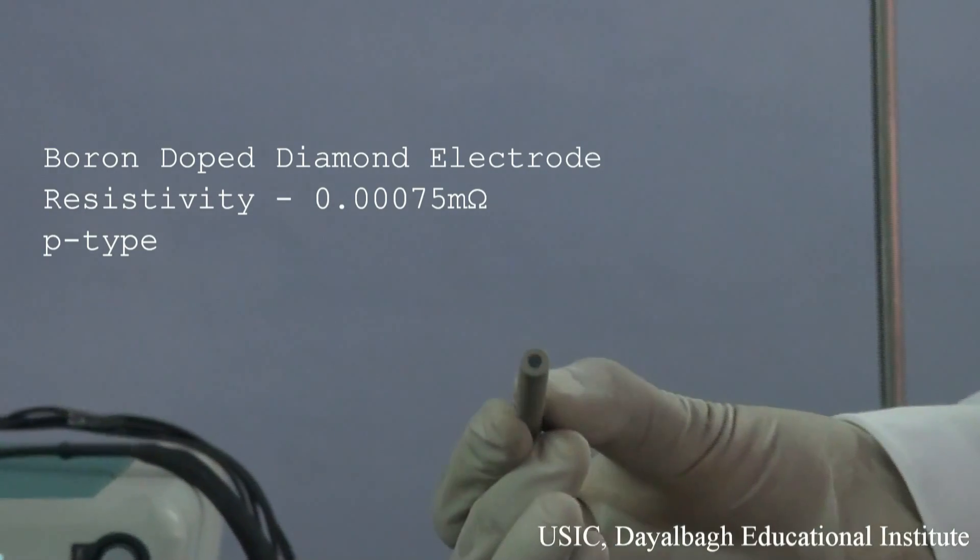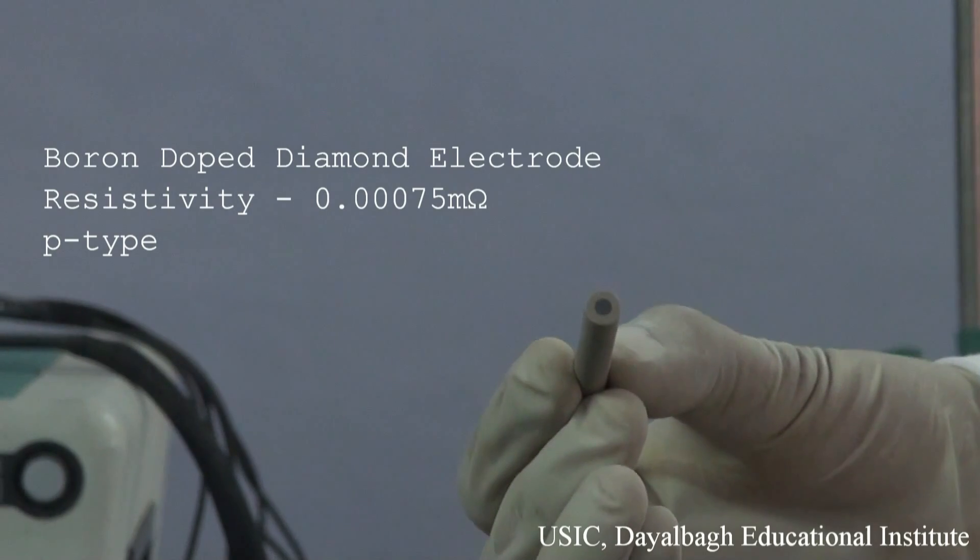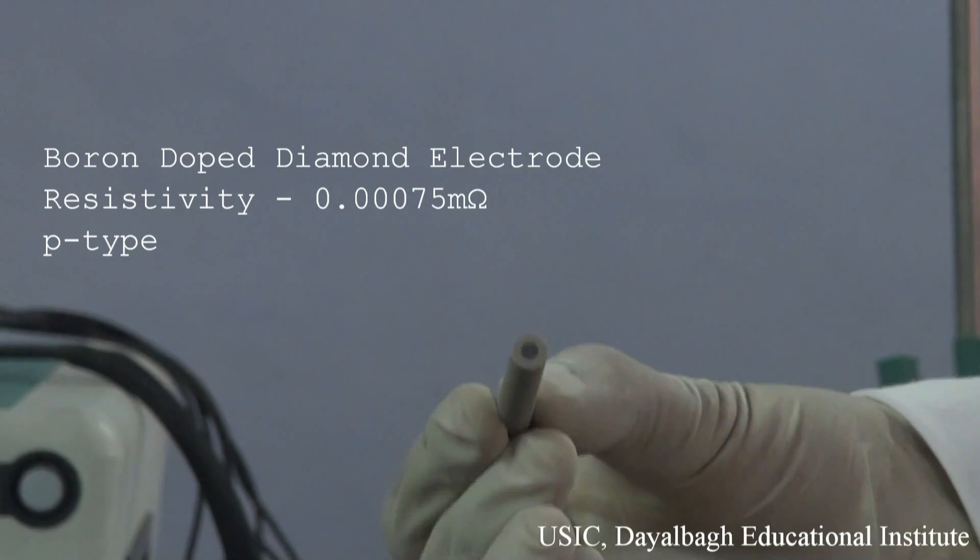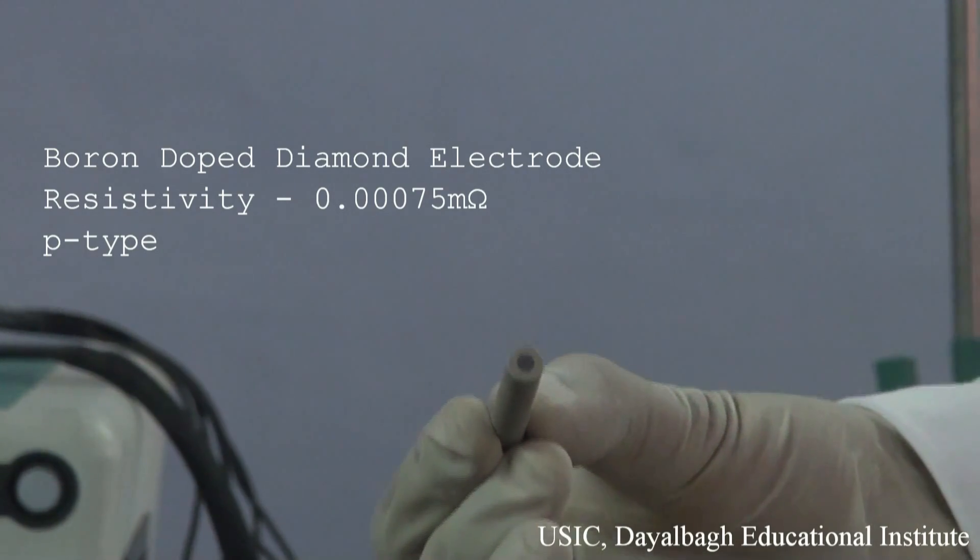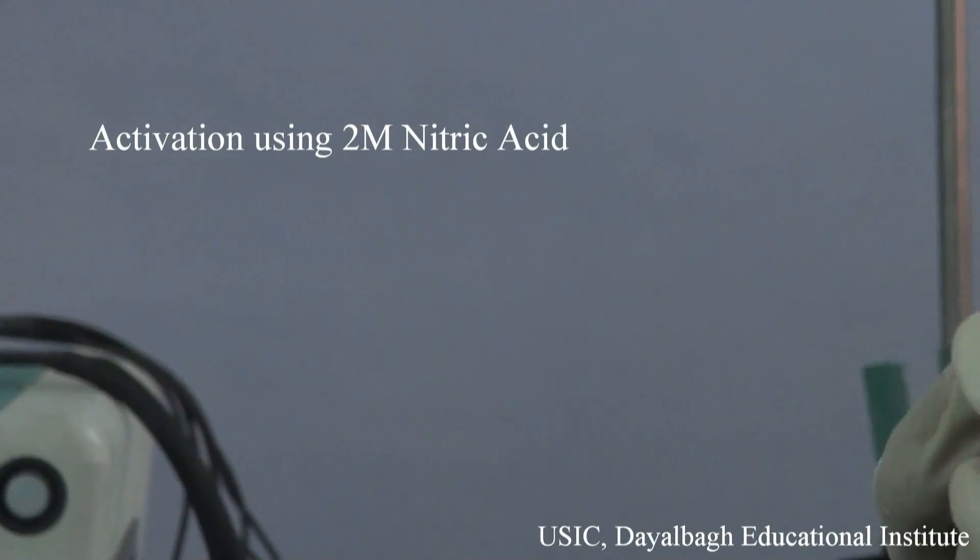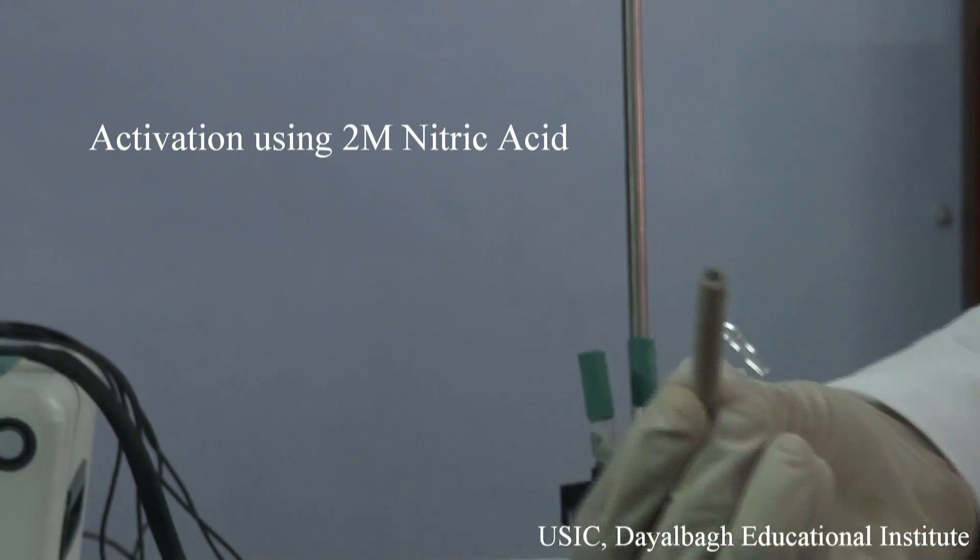Now, this boron-doped diamond electrode is a highly conducting electrode. It has a resistivity of 0.75 into 10 raised to the power of minus 3 milliohms. We have already activated the electrode for the analysis of the water sample.